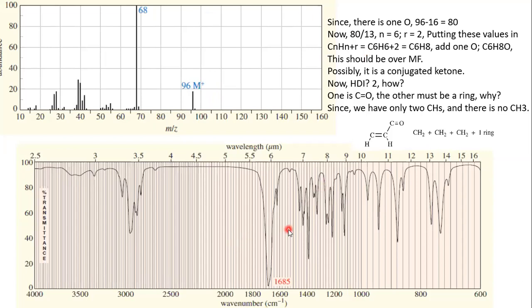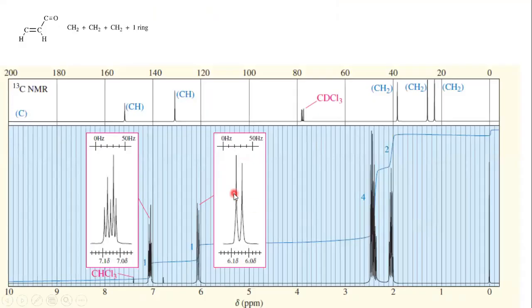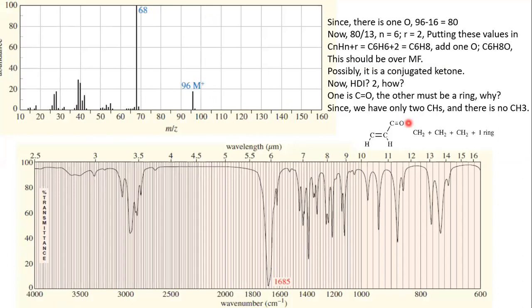We have this IR spectrum with us. And on the next page, we also have a proton NMR spectrum and a C13 NMR spectrum. So we will be going through these spectra one by one and trying to elucidate the structure of our compound. This is a compound whose mass spectrum is given to us, and in this mass spectrum we have this molecular ion peak. And we don't have any other information except these spectra.